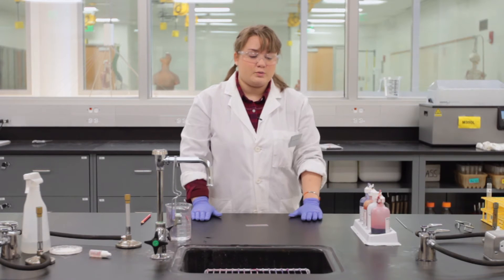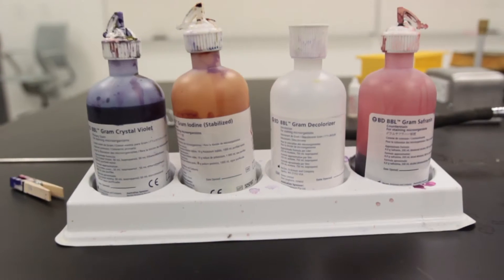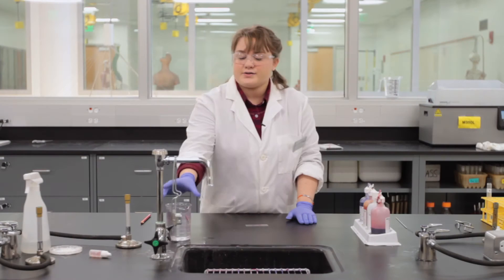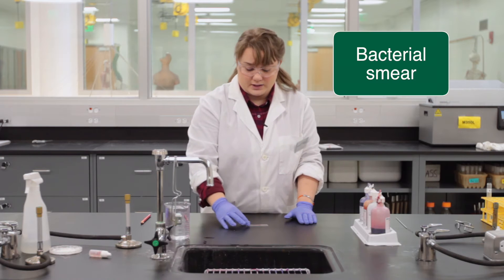What you want to do first is find your stains: we should have crystal violet, iodine, ethyl alcohol, and safranin. You also want some water handy and you should have your bacterial smear.